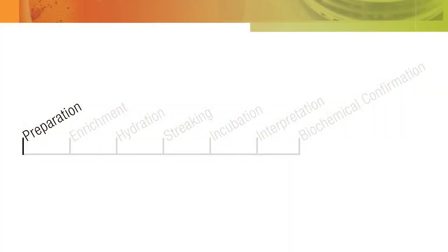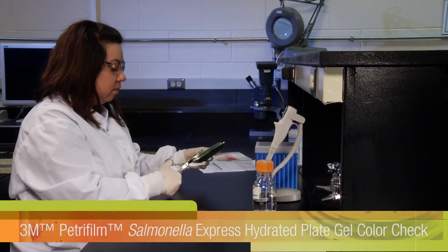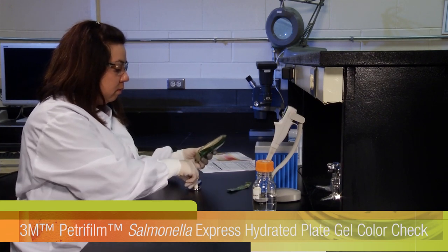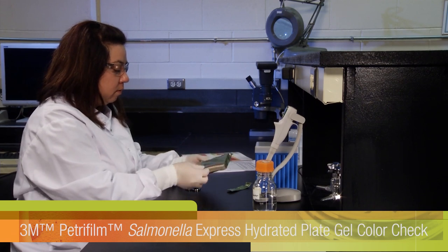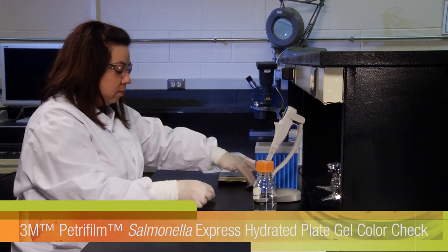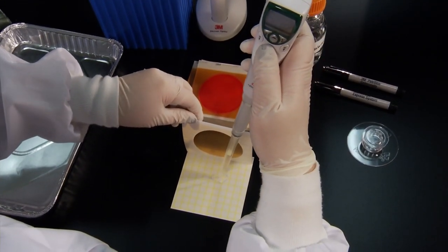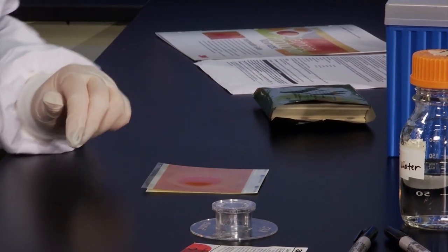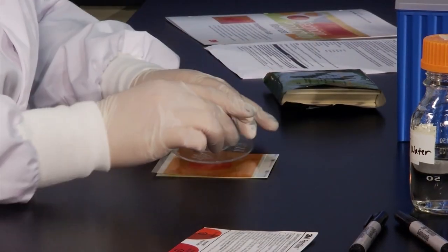Before using your 3M PetriFilm Salmonella Express plates for testing, check the color of the hydrated plates gel to ensure that the plates have not been exposed to extreme high temperatures. Remove one plate from the pouch and dispense 2ml of sterile distilled water, reverse osmosis water or Butterfield's phosphate diluent onto the plate.